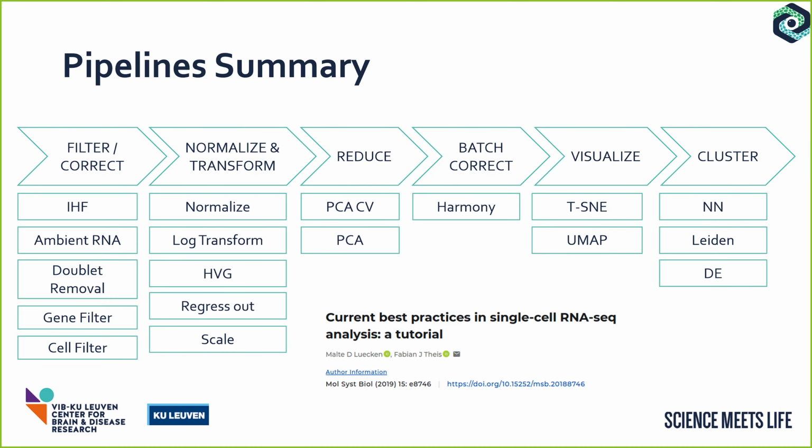So, a very brief overview of the pipeline. It's not technical, just to give a very quick overview. We've tried as best as we can to follow published best practices for analyzing the data. This is a very broad overview of what the analysis actually looks like. You can see each of the different steps here. Importantly, we have batch correction in there because without that, we don't get such nice clustering. We have clustering, etc., with the Leiden algorithm.